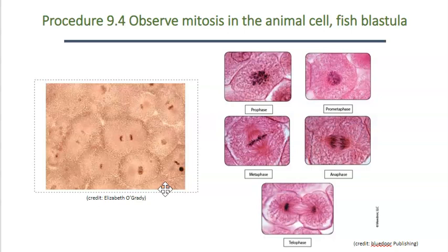When does, for example, the nucleus begin to break down? When do the sister chromatids get pulled apart? Really, you will be held accountable for understanding and knowing when those different events happen. And it's also important that you can determine the amount of time spent in each of the stages during cell division. So knowing that equation and being able to calculate, using that calculation, the time spent.